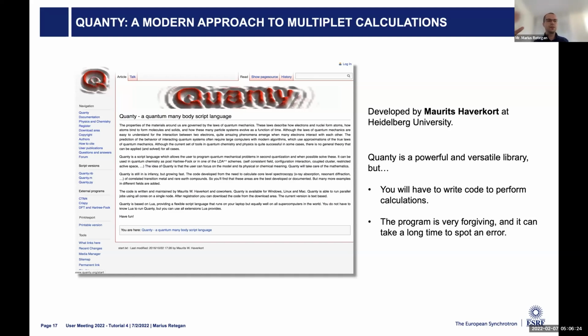If you want a comparison, it's similar in idea to what you've seen for the data analysis with DAX. You have a library, you build your calculation program, and then it becomes something that you run, and you get the output.